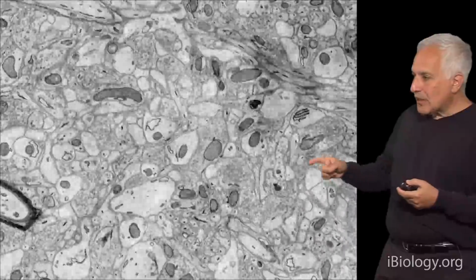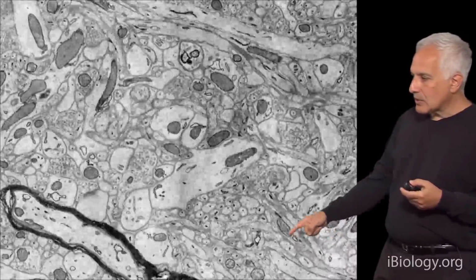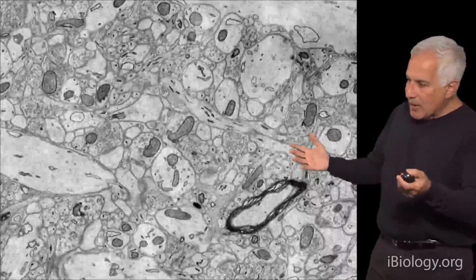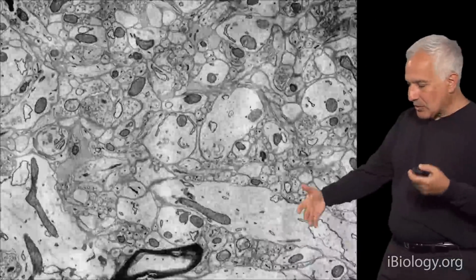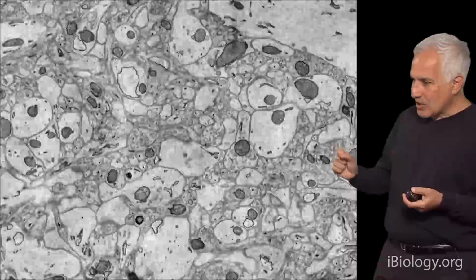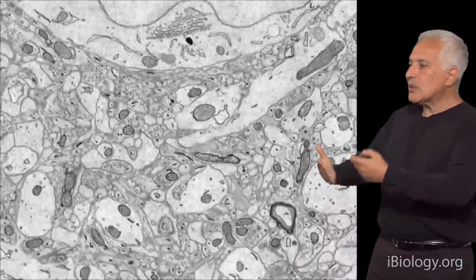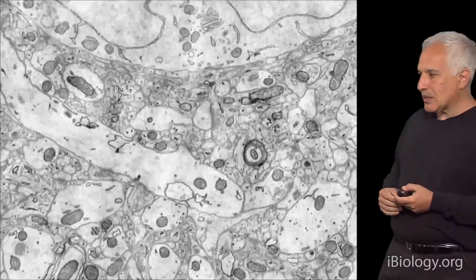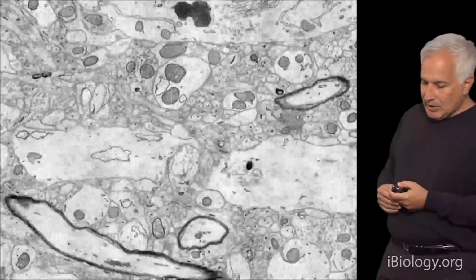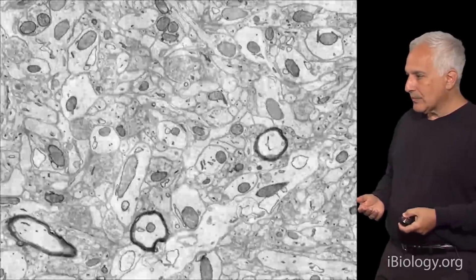And if you look carefully also, you feel like you can follow many of these objects from one section to the next. In fact, if you gave a five-year-old a coloring book with 1,000 or 10,000 pages of black and white like this, gave them a crayon and asked them to color the same object in the same color from section after section, you could get the wiring diagram of data like this. Daniel Berger built such a coloring book for digital use, and I'll show you that in the following slide.